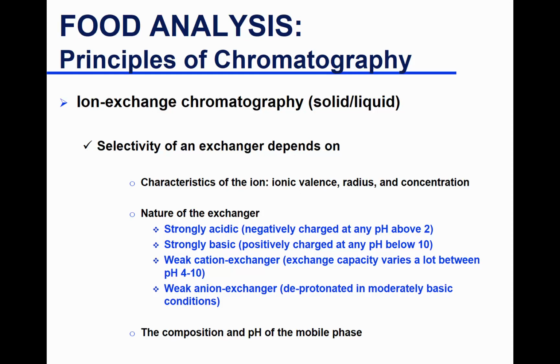So basically the uncharged one is not going to interact with anything and is going to go with your mobile phase and elute first. And the one that is most charged will interact the most with your stationary phase, and then it will stay longer, and while it's moving, it's really hindered back by all these charges and interacting with these charges. Whereas the least charged will interact less and go first. So the valence here, this has the highest valence, this is the lowest, no valence.